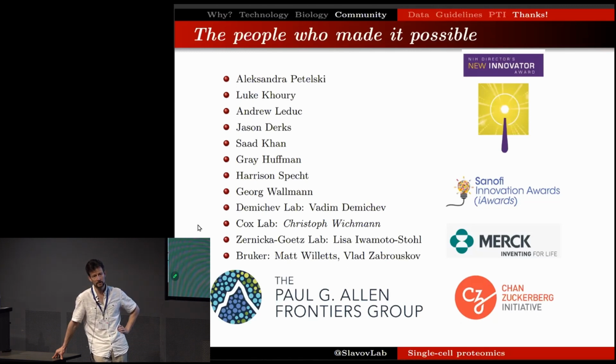So that's not a good precursor to put on the inclusion list. But we did not find this to be a significant limitation. So you can put there any precursor you want.